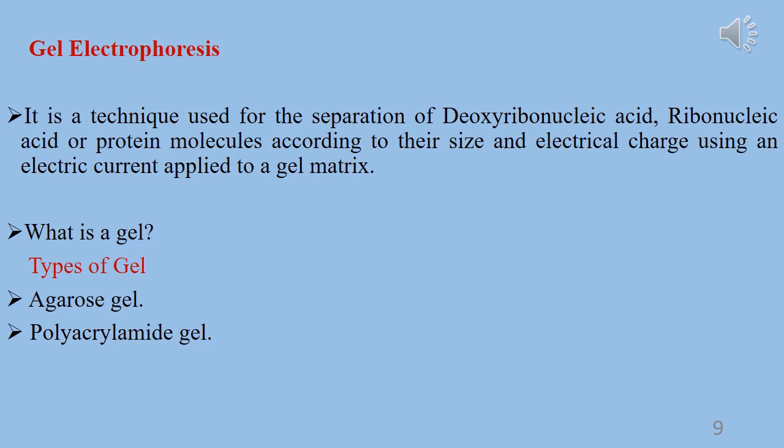Next is polyacrylamide gel electrophoresis, frequently referred to as PAGE. Cross-linked polyacrylamide gels are formed from the polymerization of the monomer in the presence of a small amount of N,N'-methylene bisacrylamide. Bisacrylamide is two acrylamides linked by a methylene group. The polymerization of acrylamide is an example of free radical catalysis.